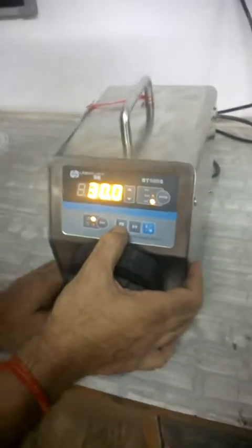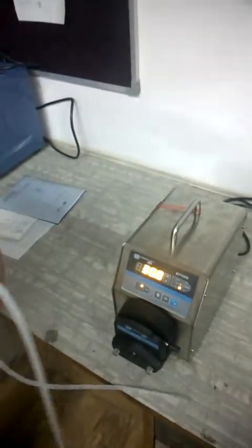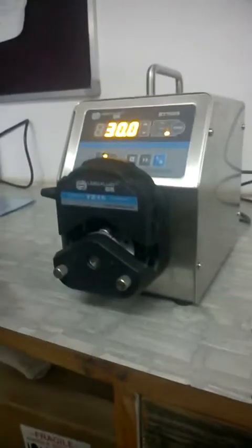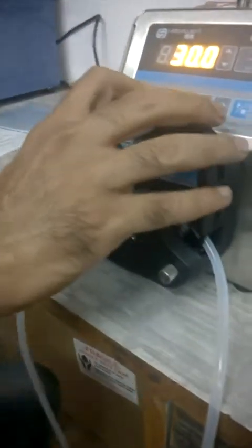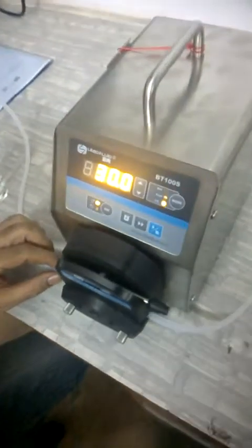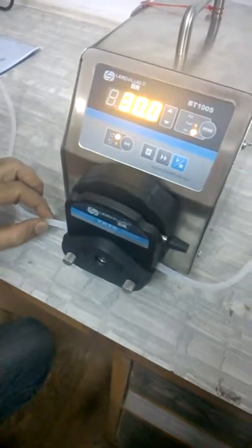We will now run the machine with tubing — this is a number 16 tubing. To load the tubing: unlock and open the pump head, slide the tubing in, lift the notch on the right-hand side and release the tubing, lift the notch on the left-hand side and release the tubing, then lock the pump head. At 30 RPM with number 16 tubing, it should give a flow of 24 ml per minute.